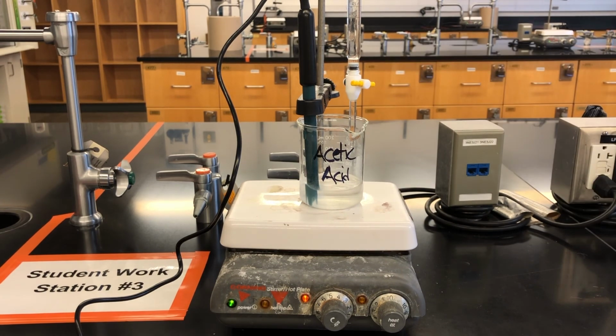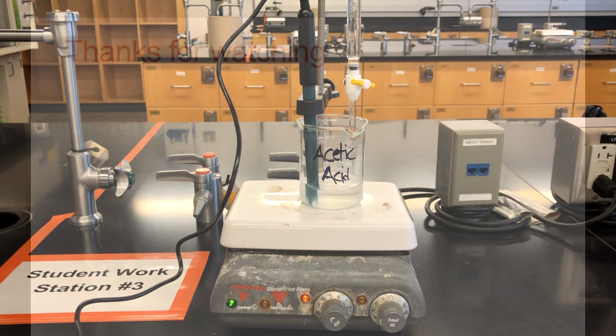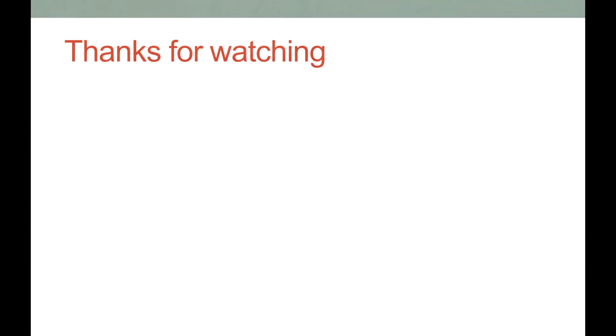Now we clean up since we're finished with Part D. We rinse off the pH probe and properly store it back in its storage bottle. All the excess solutions are poured into the proper waste container, and the burette and other glassware are rinsed thoroughly. With this, the experiment is finished.